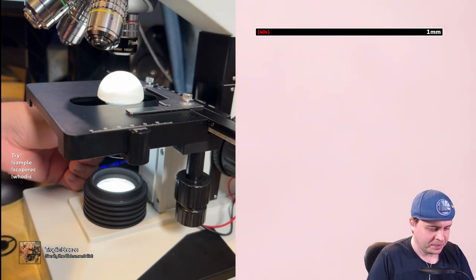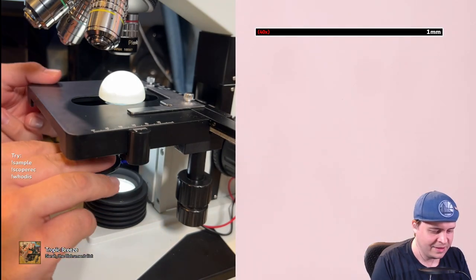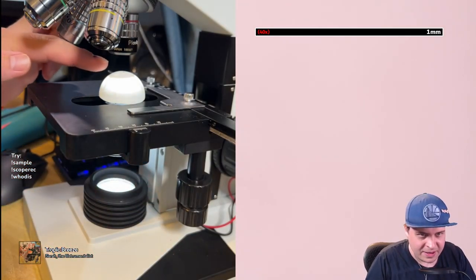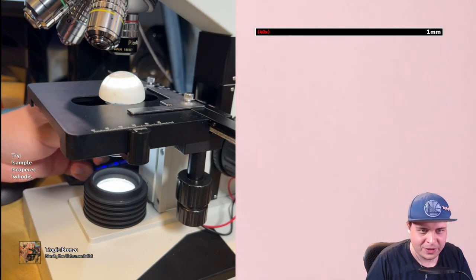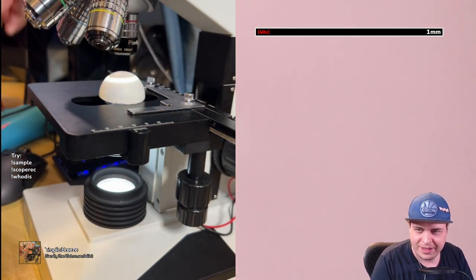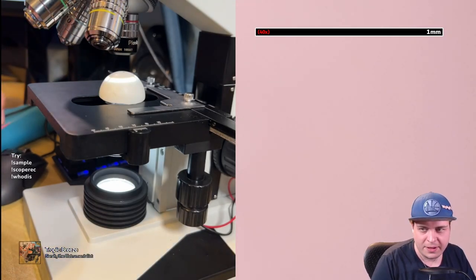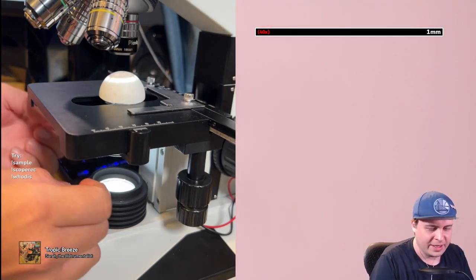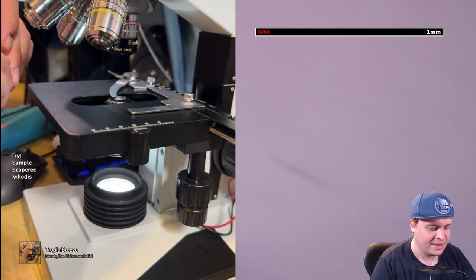I want to show the effect of putting in a dark field filter. I'll swing out the filter holder, put the filter in, and swing it back into place. Now you can see there's a section in the middle of the light cone that's in shadow — that's the light that would go directly into the lens. That's all the dark field filter is doing: obscuring the light going directly into the lens, which is what causes the bright field we see.